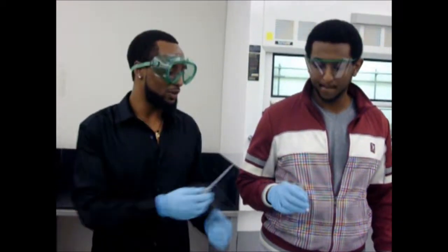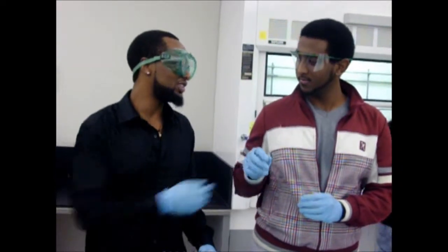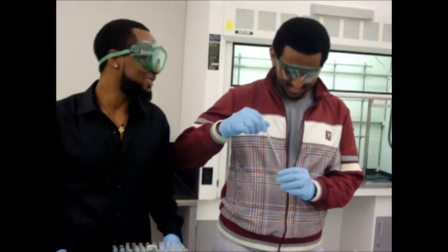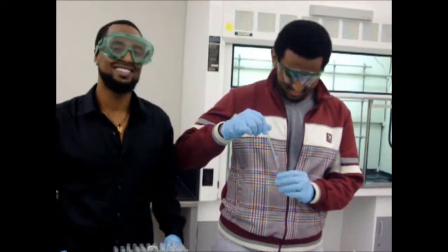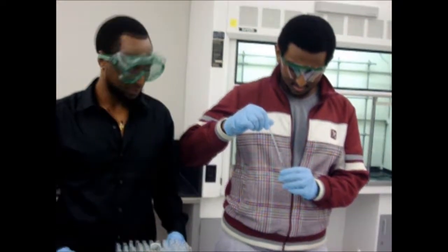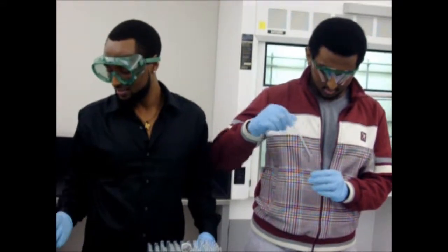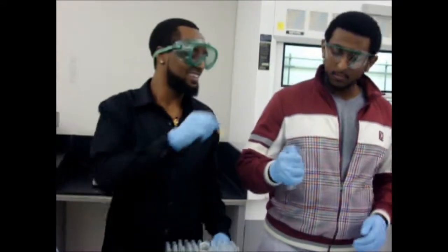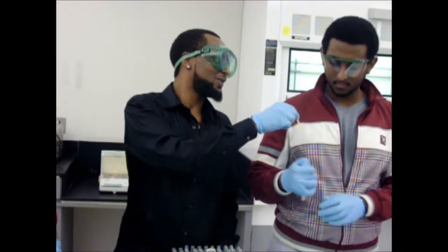deionized water. So if you could please put some deionized water in there. Thanks. If you could test our water sample.